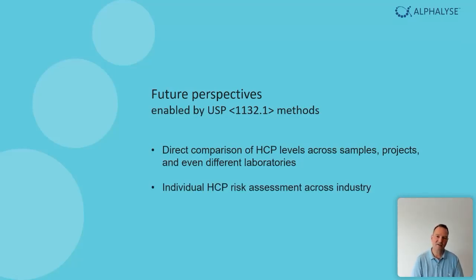risk assessment of the individual HCP across the industry. So in the future, we will know what level of HCPs are safe to have, what patients have seen before, and whether these levels are problematic or not. We can compare between different laboratories because we use the same method and the same reference standard. It also enables release testing using LC-MS only.